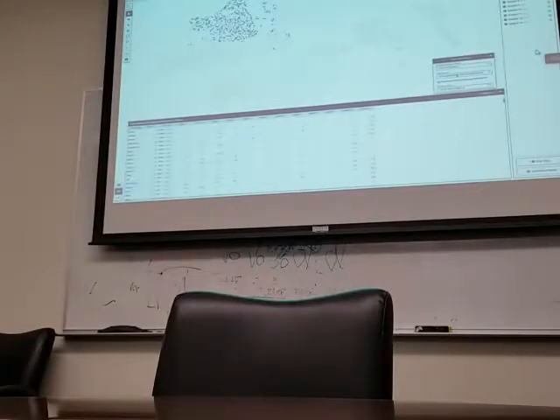Could you do that just as an example? It sounds like you can do that pretty easily. Can you go ahead and make that file and save it, and even email it to us? Yeah, definitely. However you do it. Like I said, you have this top 100. But I can also export these. The top 100 is fine.